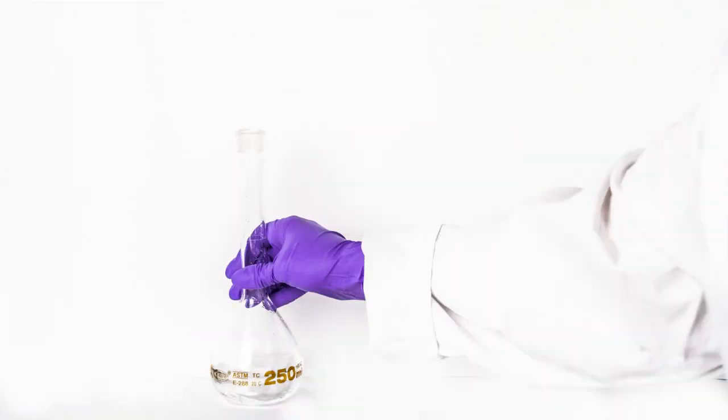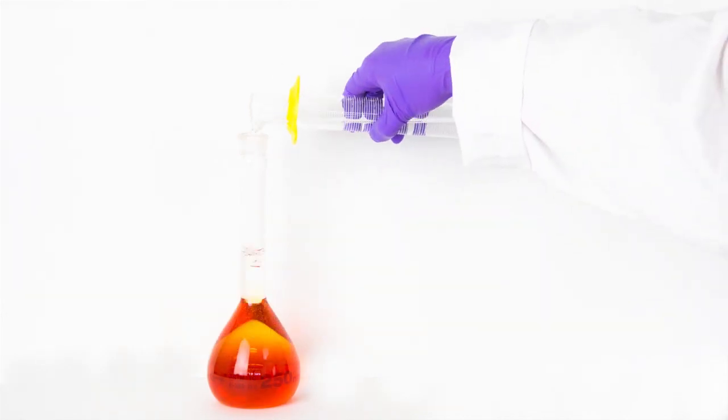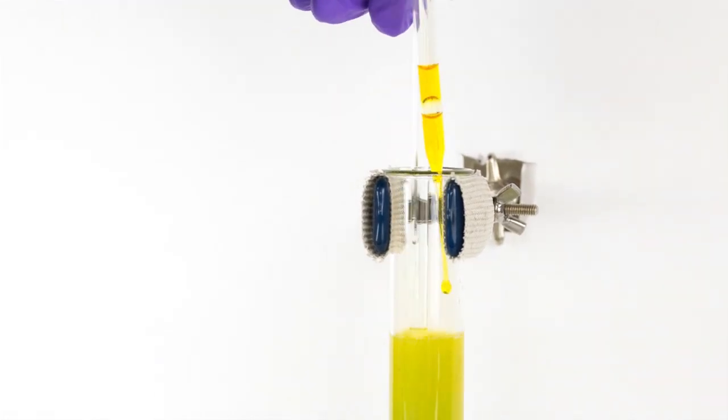First we made bromine water. Quite simply this is molecular bromine dissolved in water. Then we dripped the bromine water onto the tomato juice to initiate this colorful effect.